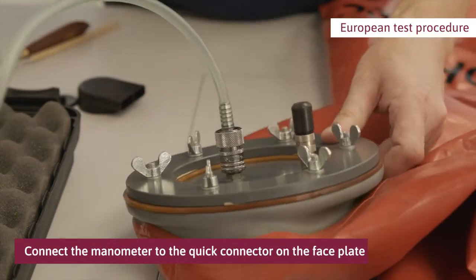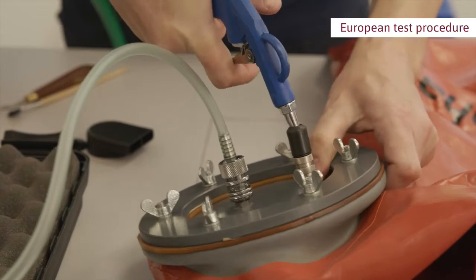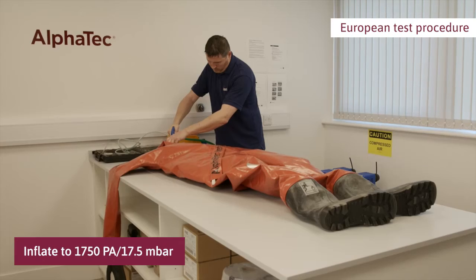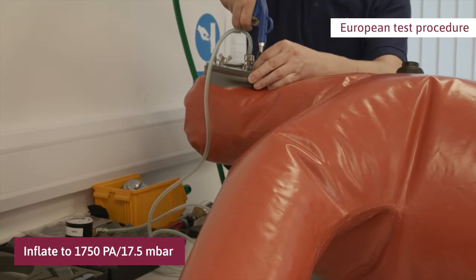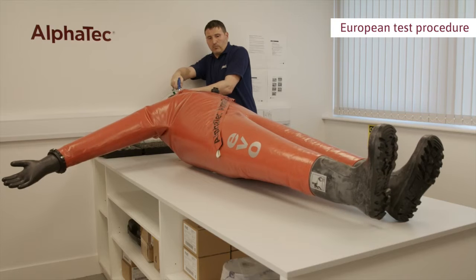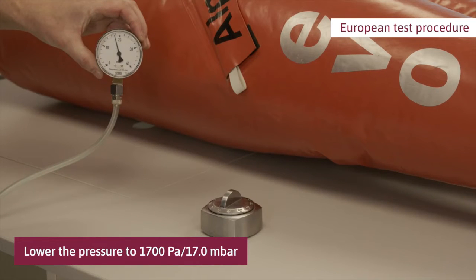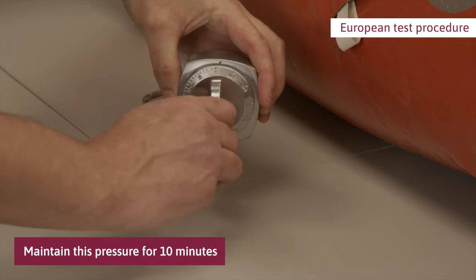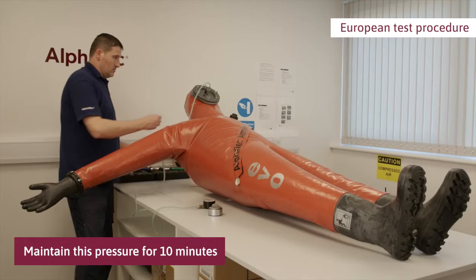Connect the manometer to the quick connector on the faceplate. Inflate the suit with an air pistol through the valve on the faceplate to a pressure of 17.5 millibar, then lower the pressure to 17.0 millibar using the valve on the adapter. This is the pretest expansion pressure. Maintain this pressure for 10 minutes in order to fill out wrinkles and allow the material to settle, adding air if necessary.